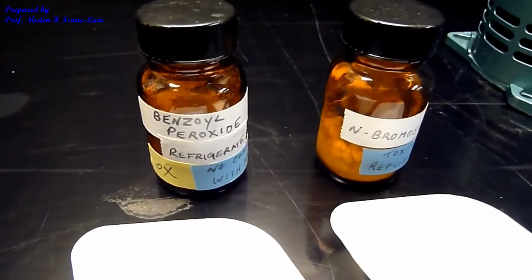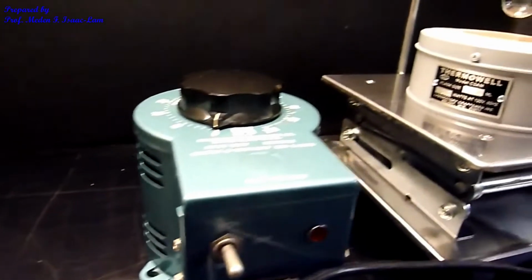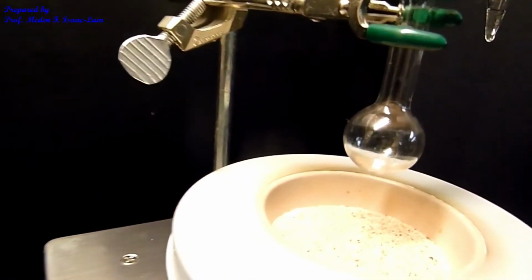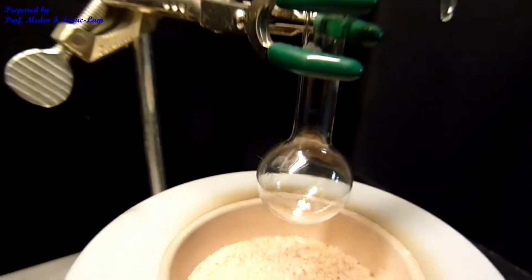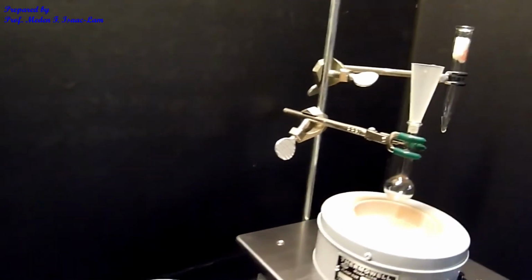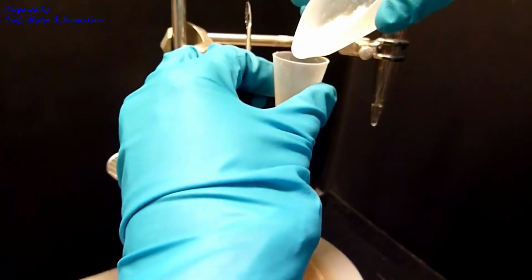I will now put it into the flask. So I have the round bottom flask, and I have the boiling chips, and I will now put them inside the RBF.